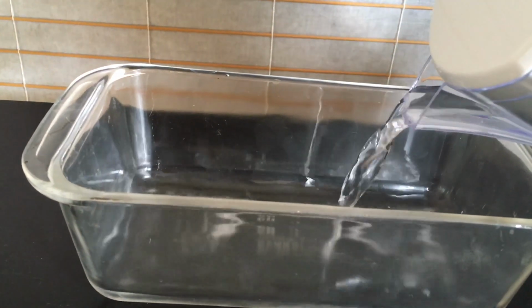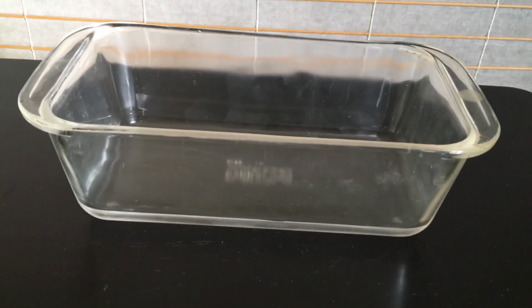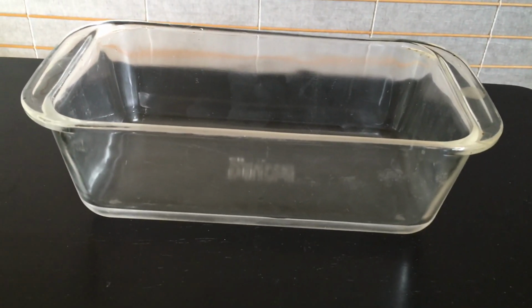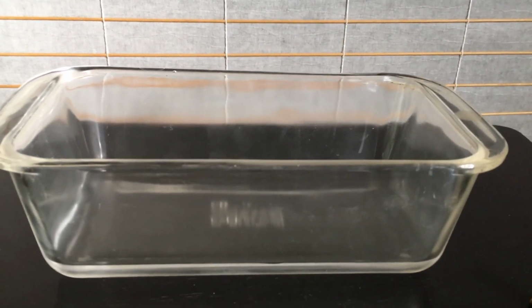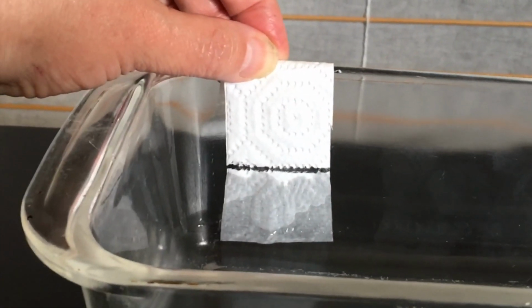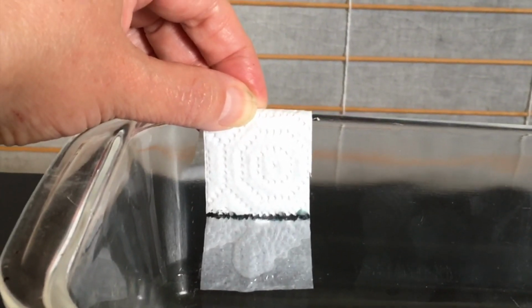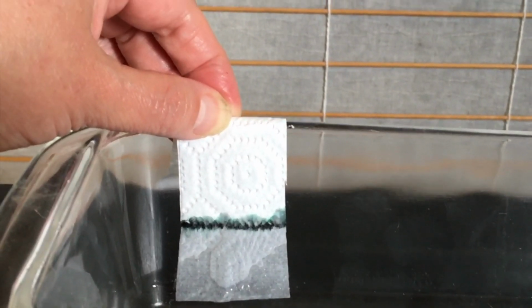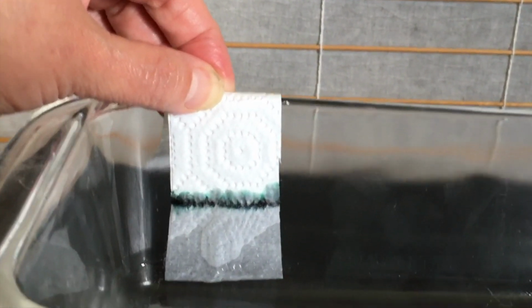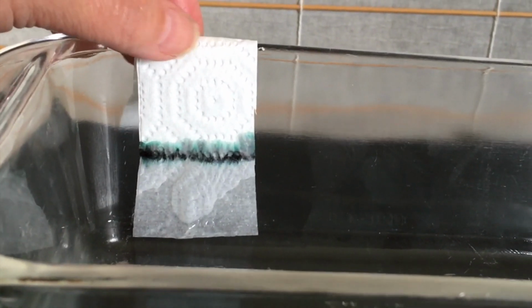Now we're going to put a little bit of water into our containers. We can use a separate container for each one, but I'm just going to use this one for all of them. I'm going to start with my evidence strip, and as I put it into the water, you may immediately see the water start wicking up that. It wicks right up really fast. So now it's starting to get to the ink, and this is what we're interested in, what it will do once it's to the ink. And you can see it's starting to separate into colors. So that is what we'd expect.